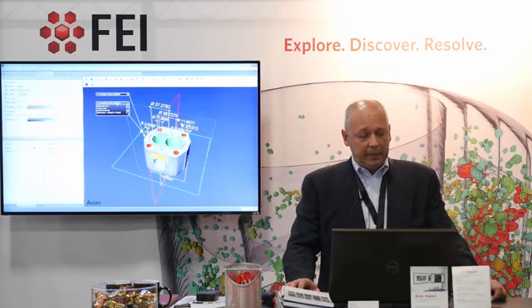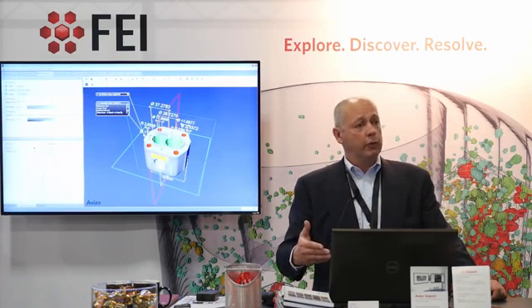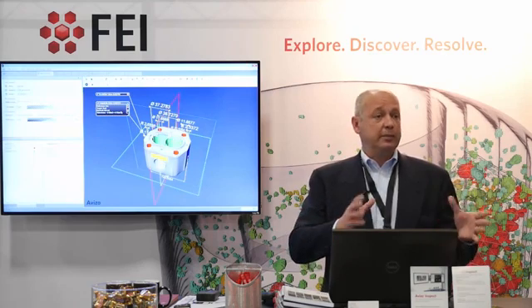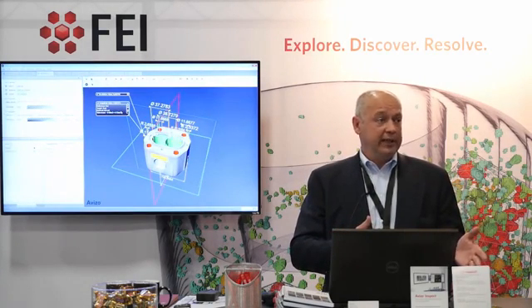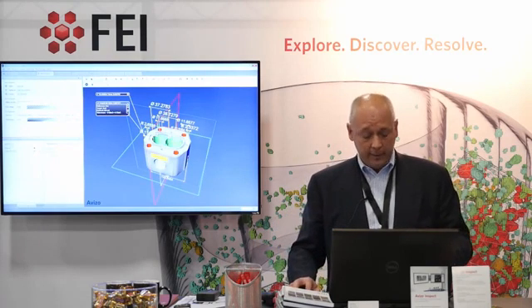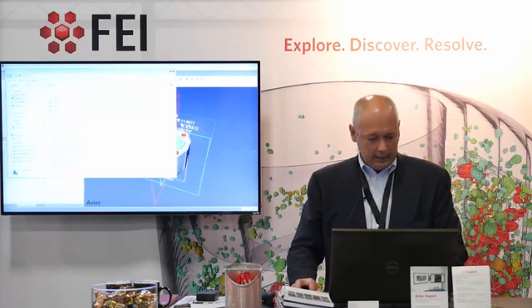So the second thing I would like to speak about is that everything you do there, you can load also a report template. This report template is based on HTML, so you have an HTML template, and you can tell Avizo Inspect to take snapshots and associate the snapshot inside a particular location inside the report, but also you may have results from your analysis and associate results, these spreadsheets, directly inside the report. And so you can get something, I'm going to show you a report that was generated there, so in PDF or in HTML.